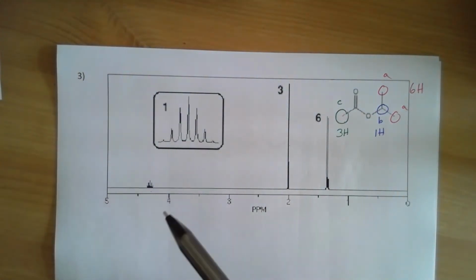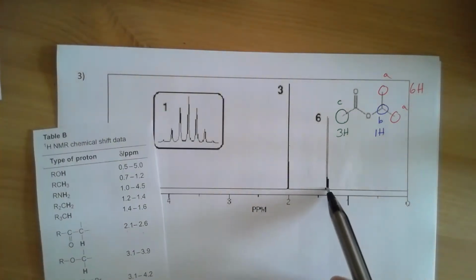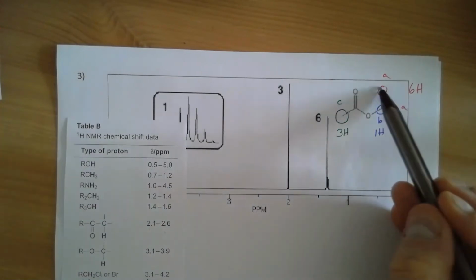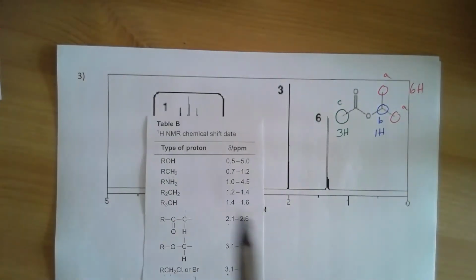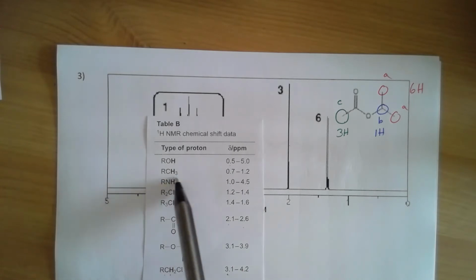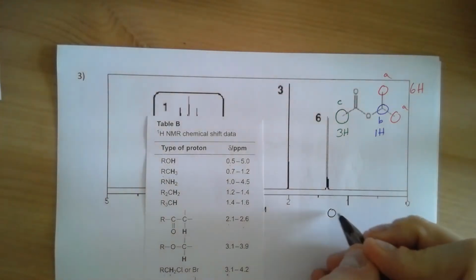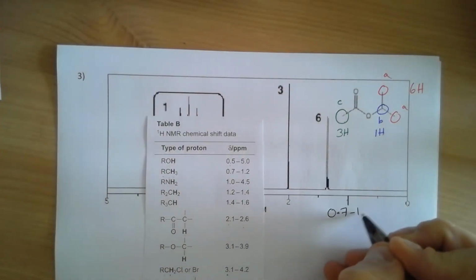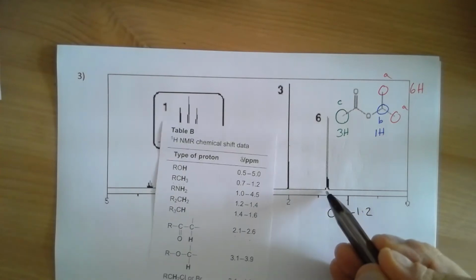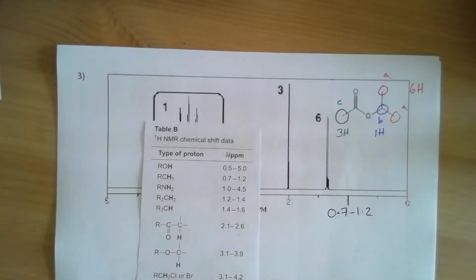Let's check it in terms of chemical shift. So in the 6 hydrogen environment, which is environment A, is very much one of the CH3 environments that's attached to an R group, which we expect to see between 0.7 and 1.2. It's not far off of there. Let's shift it up a little bit, so that's about 1.3, 1.4, but that's going to be due to the effect of the oxygen there.